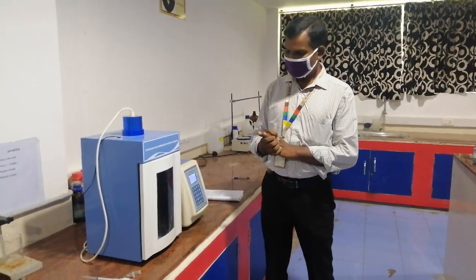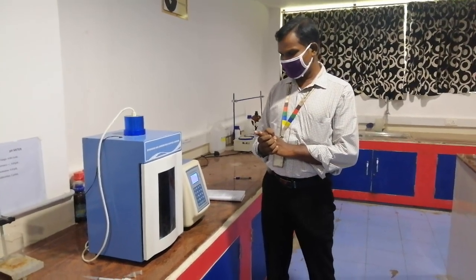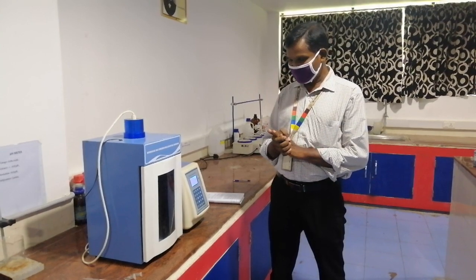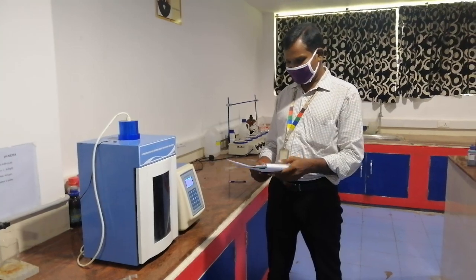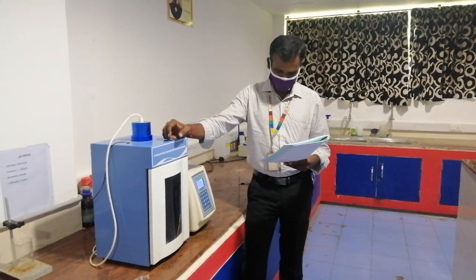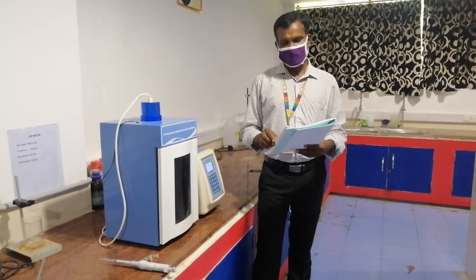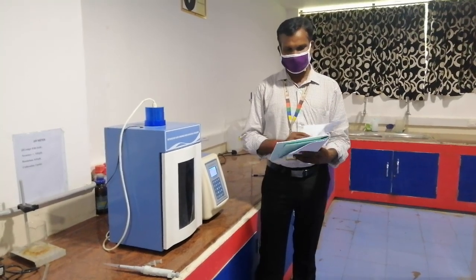Then we have the formula ln(1 minus C by C max) equal to minus Kn. And the C is C1, C2, C3, C4 up to C10, and C max. Then you can find the ln(1 minus C by C max) for each number of cycles. Then plot a graph between ln(1 minus C by C max) versus n. Here the number of cycles or time is on the x-axis, and ln(1 minus C by C max) on the y-axis. C by C max is simplified into capital R in your manual. So by plotting this graph, you can find the rate constant for the cell disruption using ultrasonication.